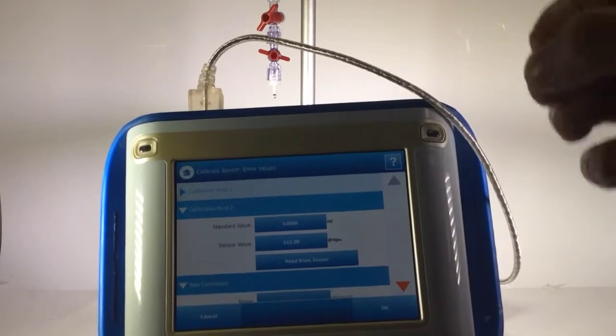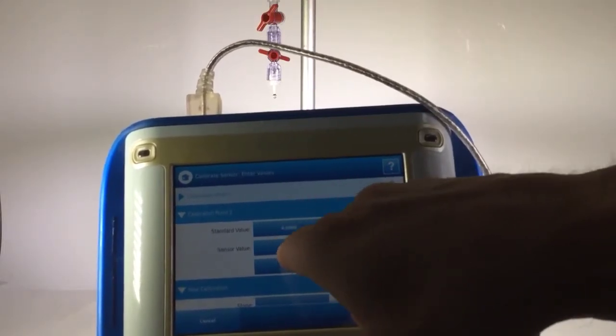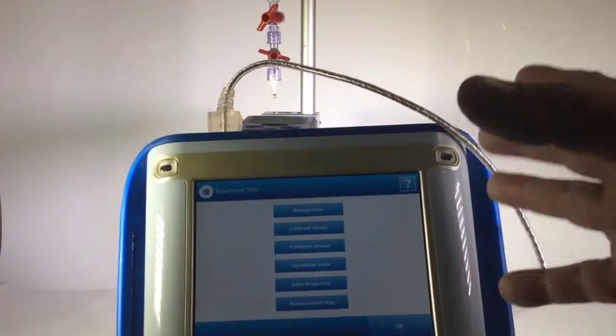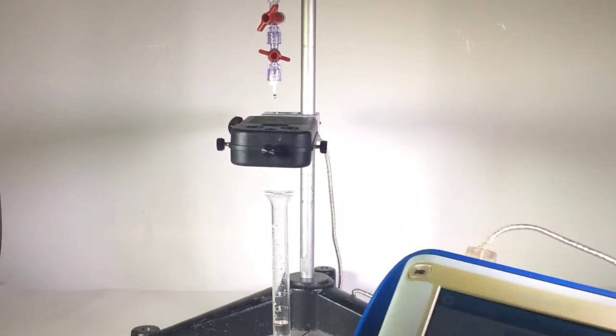So it now knows that, excuse me, 211, that 211 drops are now equal to four milliliters. So this device is now calibrated and ready for use in the classroom. Thank you.